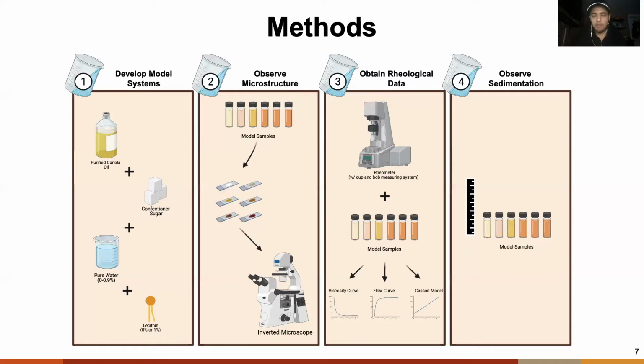And then finally, I want to observe sedimentation. And so this is just part of observing and understanding the microstructure. What sedimentation tells us basically is what are the different forces going on within the system?